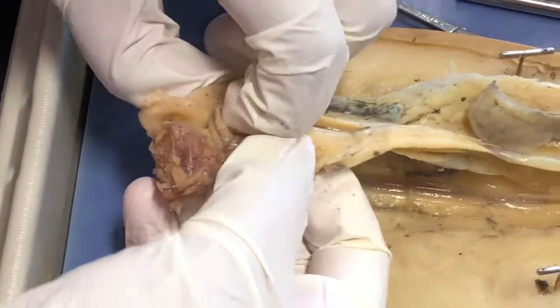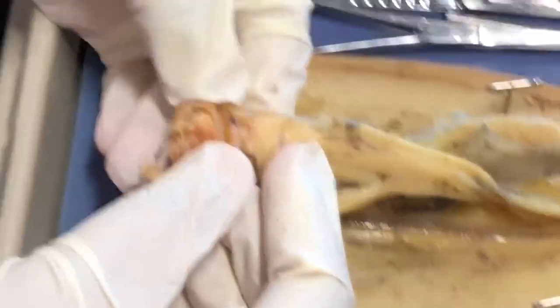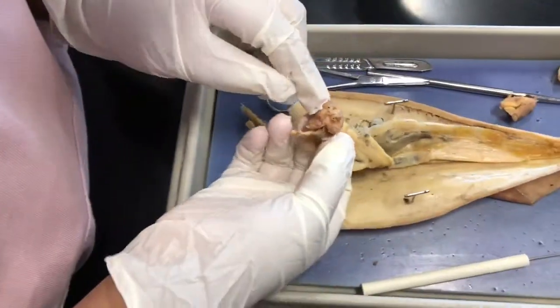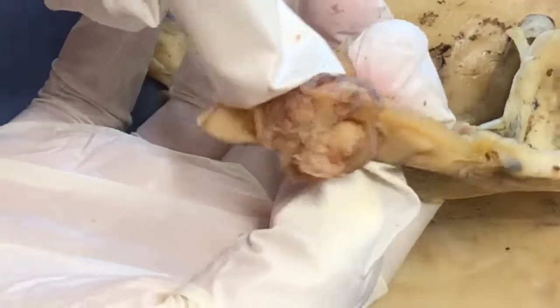Right here I found the brain capsule and the brain. The brain capsule is basically this hard structure that envelops the brain. Because of the brain, the eyes can move rapidly and are controlled, and the eye has a singular lens.